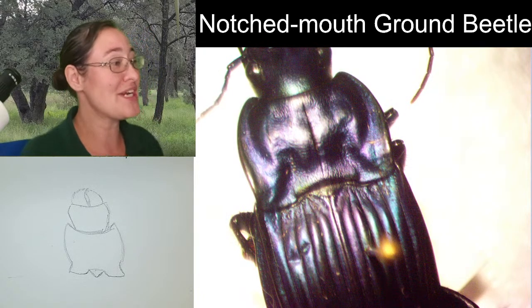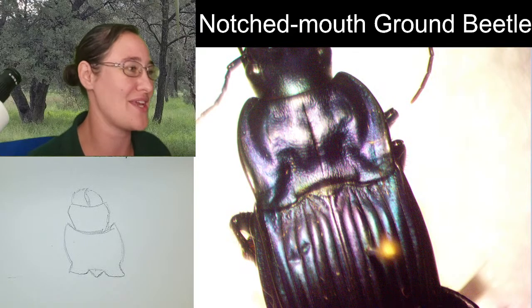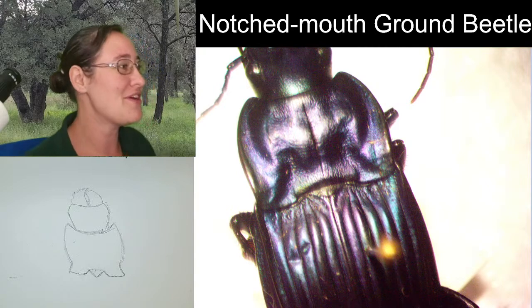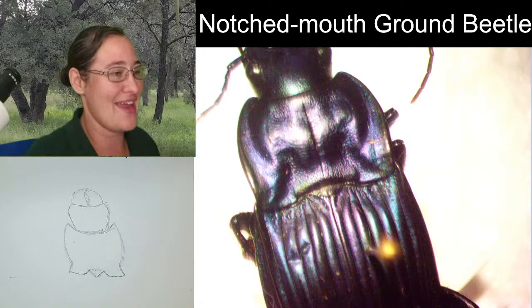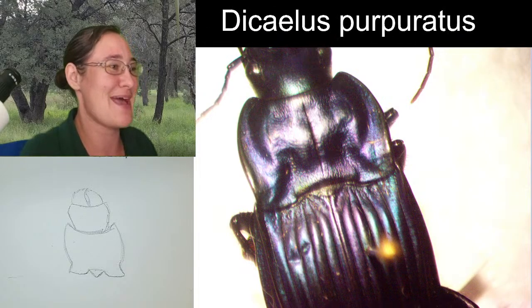We're going to have to zoom in on the mouth of the ground beetle and see if we can determine why exactly it's called a notched mouth ground beetle. But I am going to go ahead and switch that common name out now, because this is my preferred name.